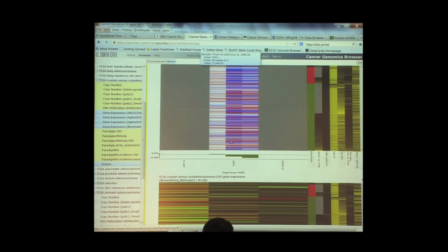Here is ER alpha, and here is another ER alpha. These are two versions of estrogen receptor that they've measured differently. And you can see that we have a significant difference between the two groups in ESR1 for total receptor expression, but we aren't affecting the phosphorylation status. Okay, so you can drill to that level of detail here.